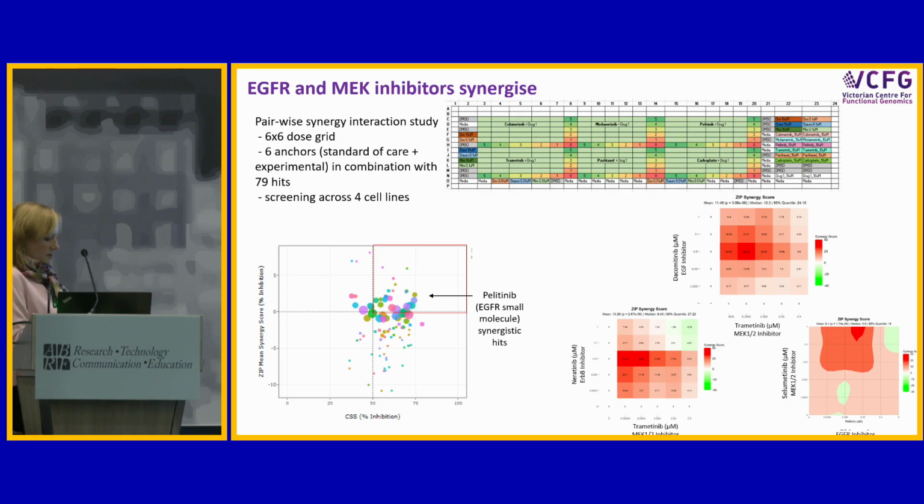So it's 180 plates, I think, per cell line as we've gone through it. But you can see this little graph on the corner shows that we've got quite an enrichment using 2 different synergy software tools. There's actually 4 that we use, and we're trying to get a little better statistical hold on which is the best one to use.